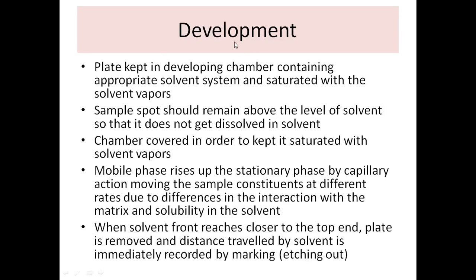And then for the development, what is the meaning of development? That is when you keep your paper or your TLC plate in a developing chamber. That chamber contains a solvent system or mixture of solvents. And you have to ensure that before you keep the plate in that chamber, that chamber must be completely saturated with the solvent vapors. Because if the chamber is not saturated properly, then the running of the solvent will not be even. It will not be uniform.